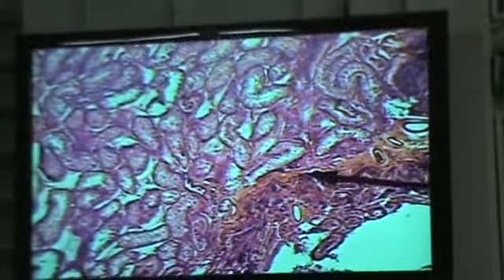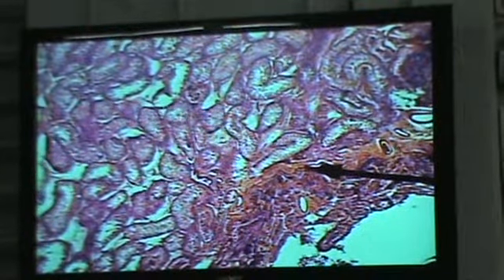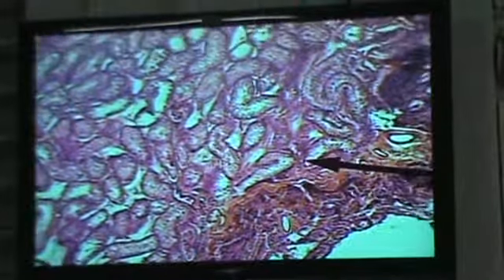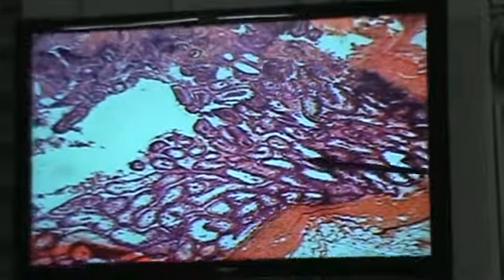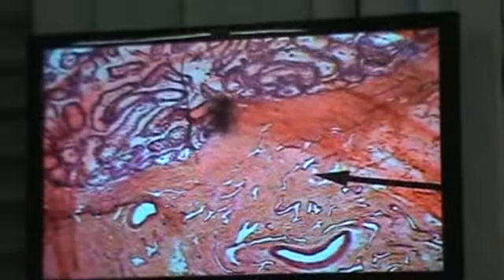So this is one of the septula testis. Alright, so there we see the septula testis right here. And then we can see how the whole thing is converging, right back here now to the area of the mediastinum testis. See another septula testis leaving right here?